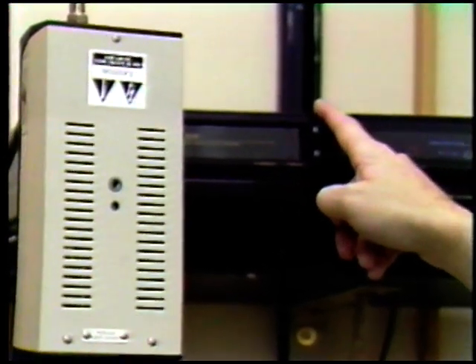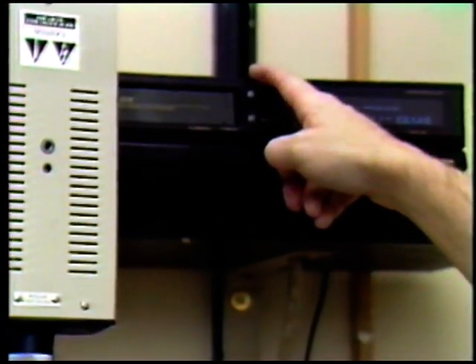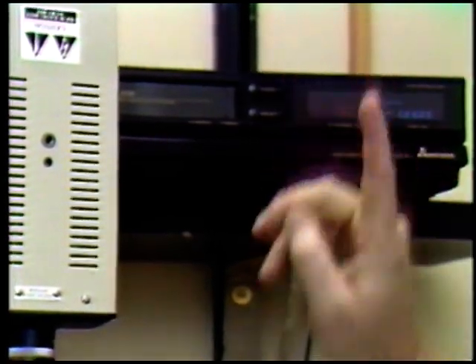Here is a VCR to record the DNA images. And there is a monitor sitting on the table to let me view the DNA as I work with a slide. This is an objective micrometer test pattern consisting of squares formed by lines spaced 10 microns apart. The pincushion distortion occurs inside the image intensifier. The following microscope images were recorded in real time at this magnification, except where noted.